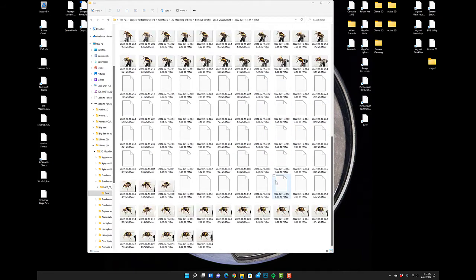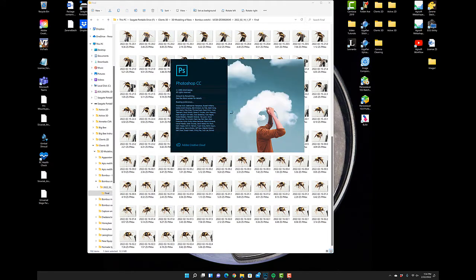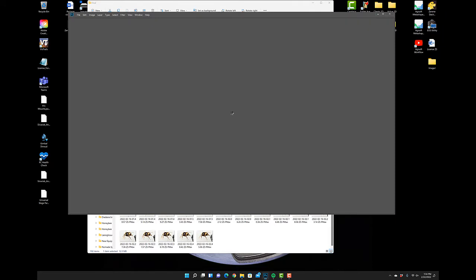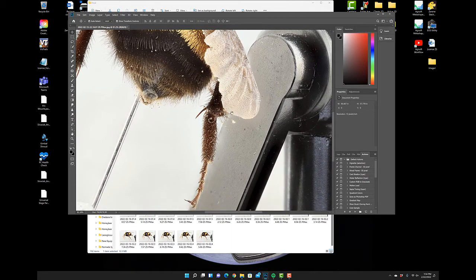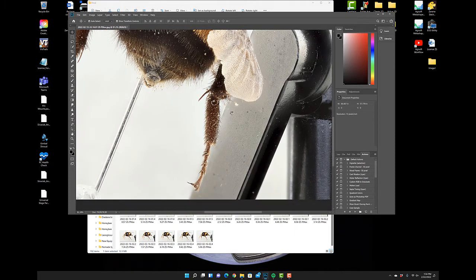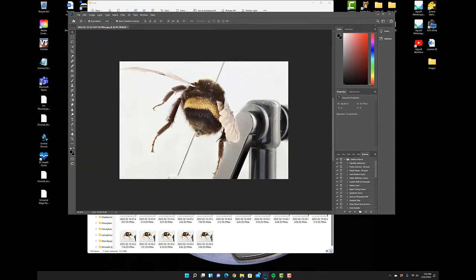So we can open up another one of those images and take a look. Yeah, so we'll open up this image where we have the stage, which is contrasted directly against the specimen. Yeah, and same story. It looks like we have the entire specimen. There's really good contrast from the specimen relative to the stage that's situated behind it. And again, there's no streaks.